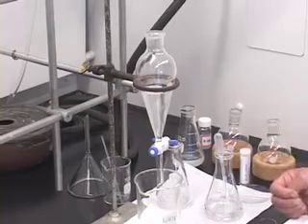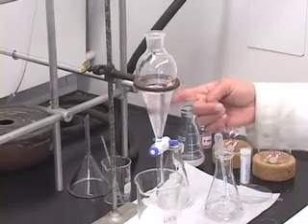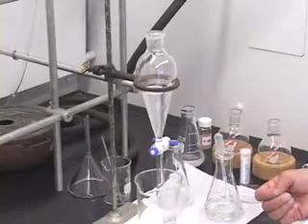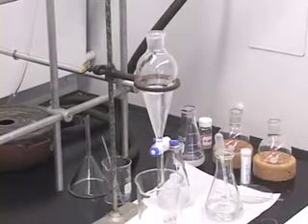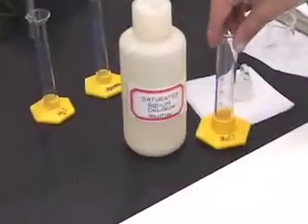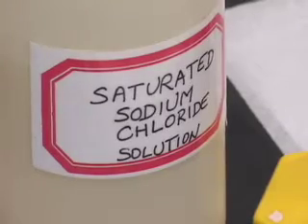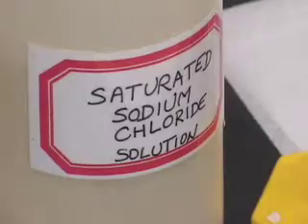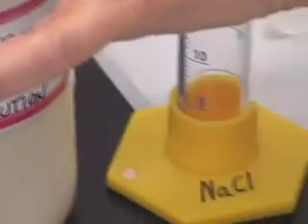So how do we get rid of this moisture associated with the organic layer? We are going to do two types of drying. First, we are going to do an extraction with saturated sodium chloride solution. We will take 15 milliliters of saturated sodium chloride solution using the graduated cylinder labelled sodium chloride.